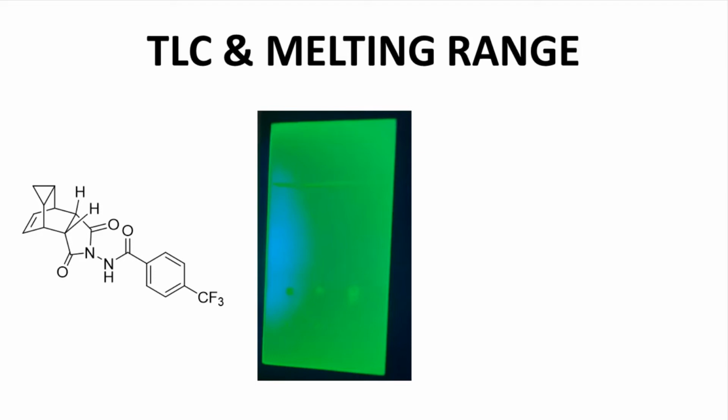This TLC shows 3 lanes. Each is the same, but the concentration differs, with the right lane being the most concentrated. Under UV light, this looks like one spot in each lane. I admit that the most concentrated lane looks like it has a smudge or streak. It's hard to see clearly in this picture, but this region here is clearly not clean when the plate is viewed in person.